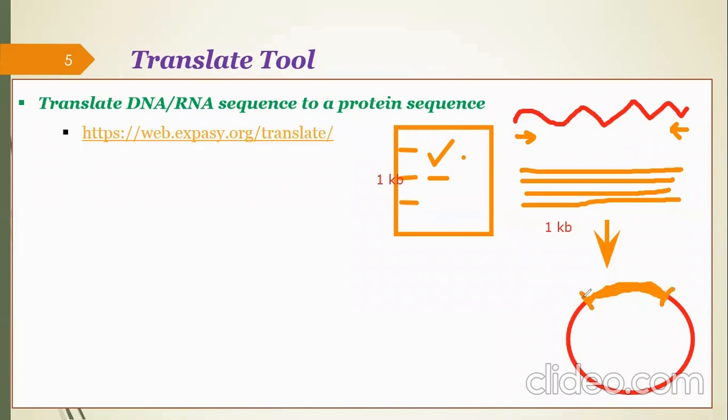After cloning in the plasmid, I need to express that. What I need is to have the protein sequence. If this is the protein sequence of that, actually I don't know the protein size. Only what I know is the size of the DNA.